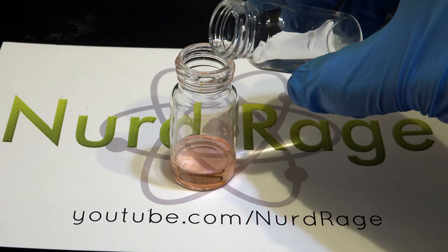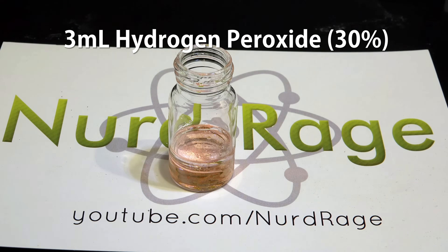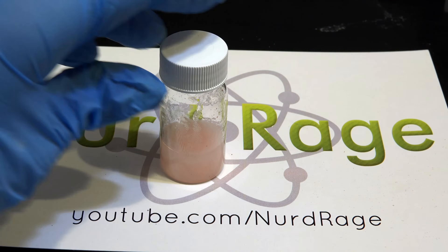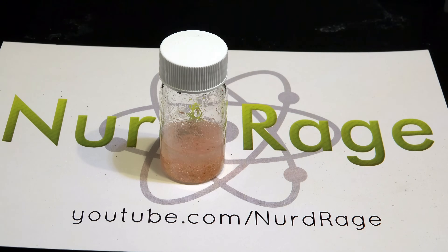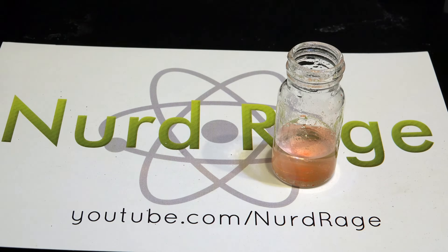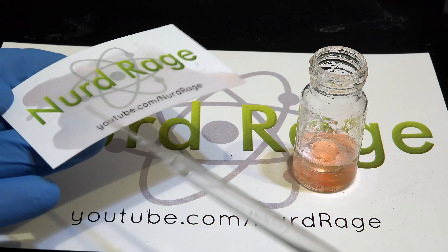Once that's all shaken up, we then add in an equal volume of 30% hydrogen peroxide. Give that a shake to dissolve as much of the hydrogen peroxide as possible, then give it a few minutes to settle. The hydrogen peroxide layer will float on top of the denser dimethyl phthalate layer. Now we pipette out the bottom dimethyl phthalate layer and apply it to a surface like this logo card.